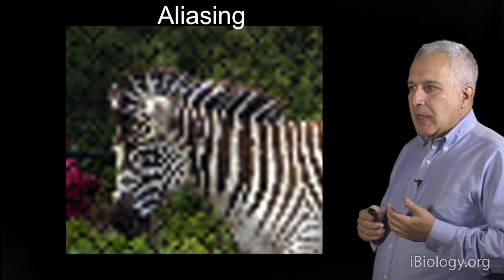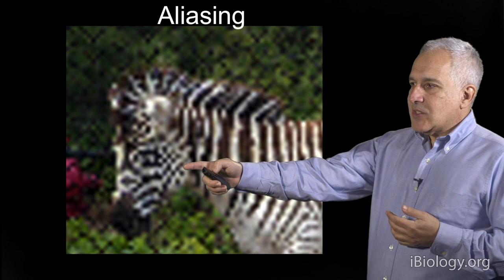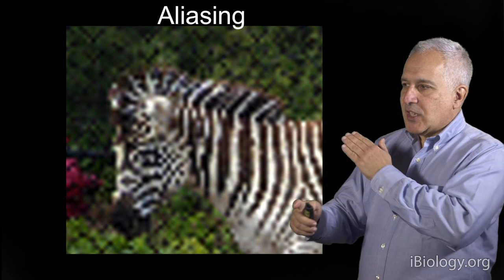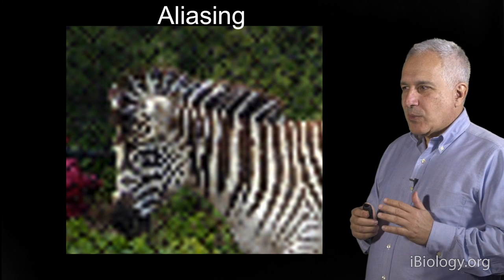But it doesn't look like a pretty good zebra. I mean, you know where the head is, but the details seem to be a little funny. And if we move up a little further, you now say, oh yeah, this is a zebra, but it has some unusual features. And one of the features I like to point out is this checkerboard of stripes here running in two different directions. And you may know enough about zebras to know that zebras don't have checkerboards. They really are striped.